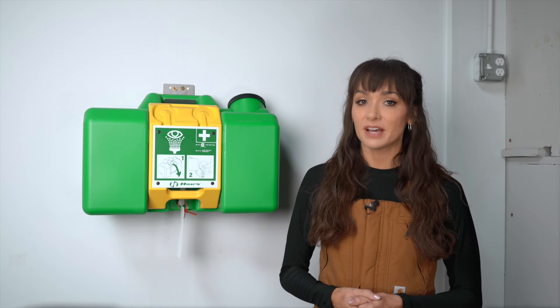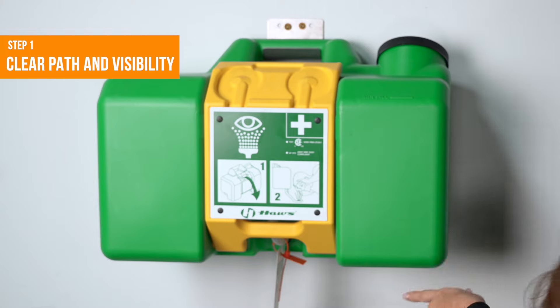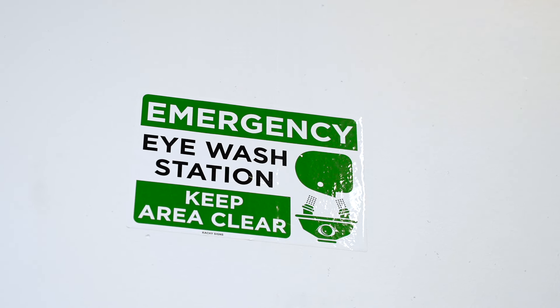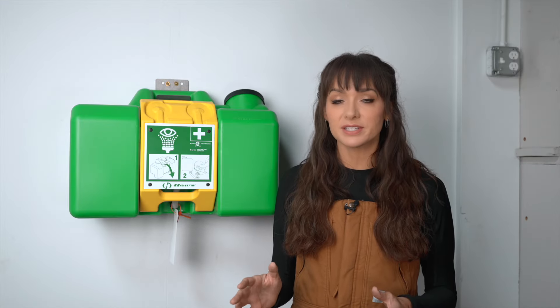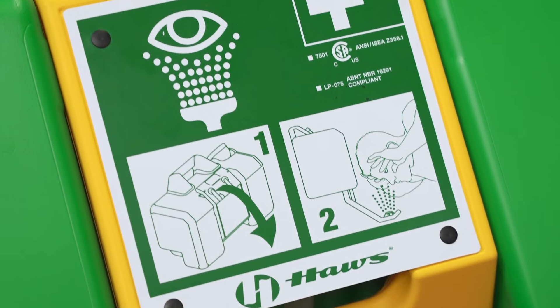Here's what to check on your self-contained eyewash station. Step 1: make sure that the station is visible and accessible, with proper signage and clear instructions for use. The last thing you need in an emergency is to move a pallet out of the way before you can get corrosives out of your eyes.